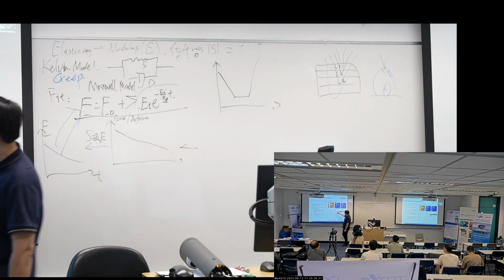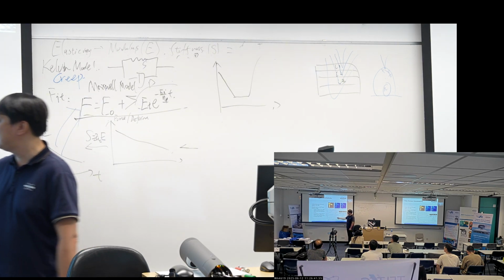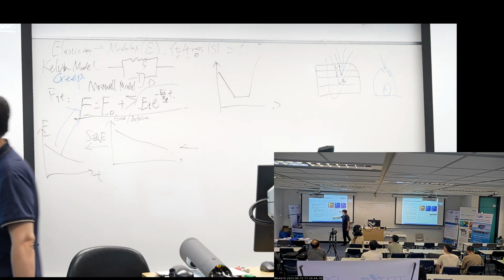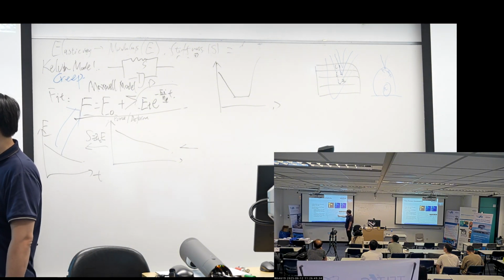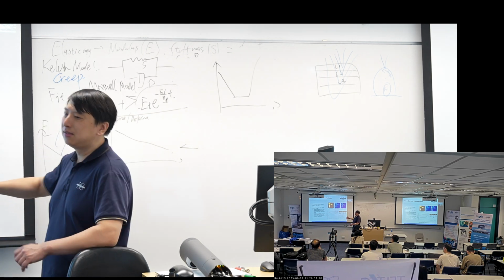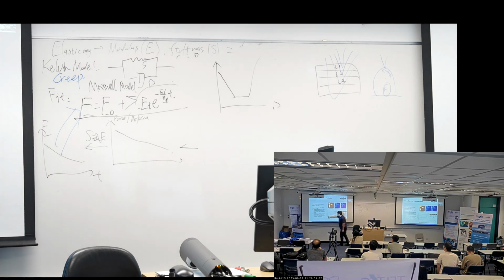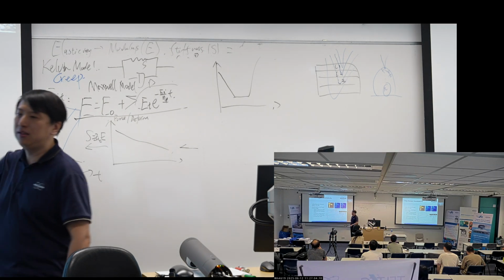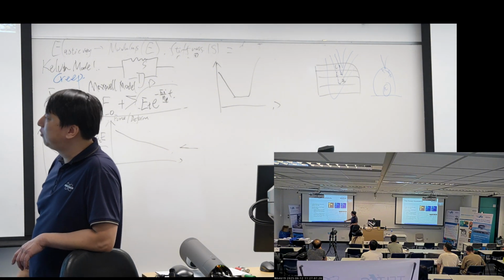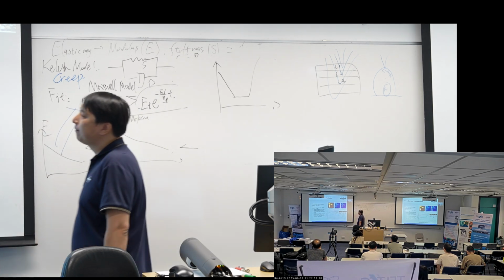He has the live E. coli, the dead E. coli, and the glass. And you can see on glass the Z almost does not change. But for the dead E. coli, it is dead, but it's still somewhat soft, so it shows some creep. And the live E. coli is the softest, so it shows a significant creep.